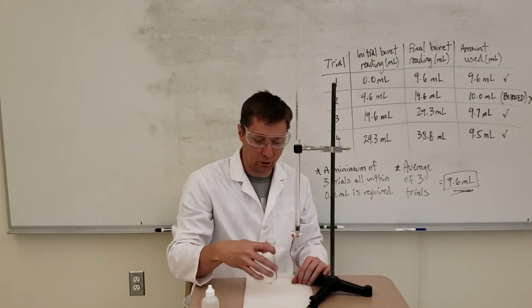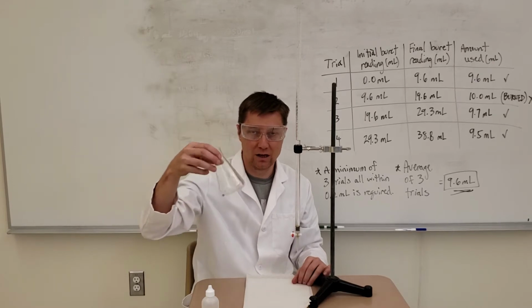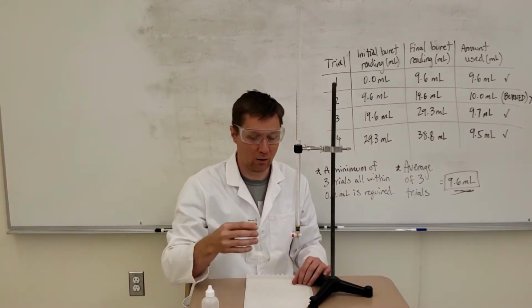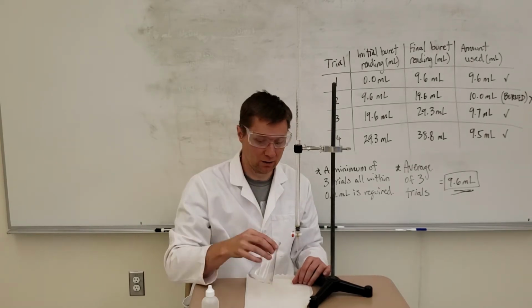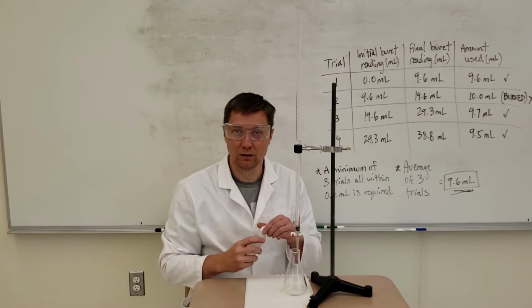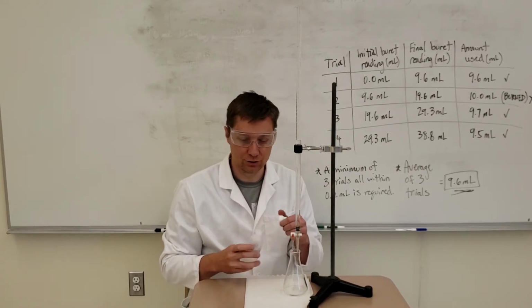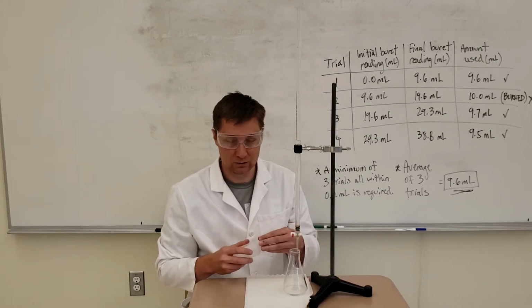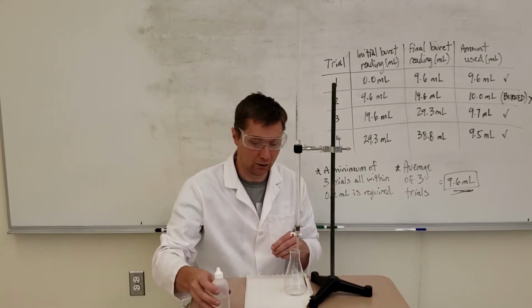Then down here below, you can see my 10 mL of hydrochloric acid, and again, I pipetted that out previously and just put it into the beaker. And then what you're going to want to do is take some phenolphthalein or whatever indicator you choose to use and put 1 drop of that in here, and I've done that already as well, so we're ready to go.